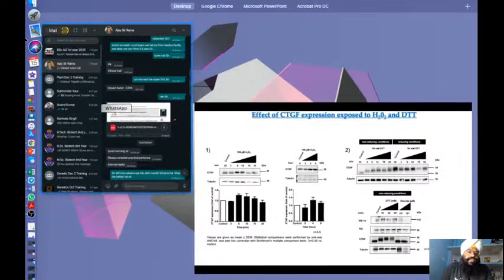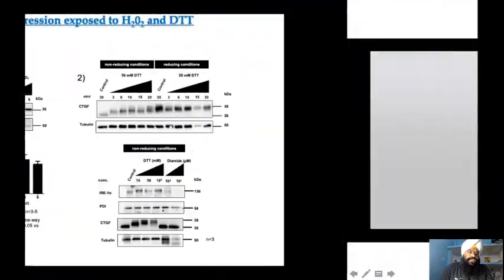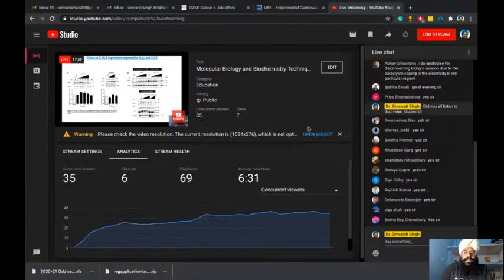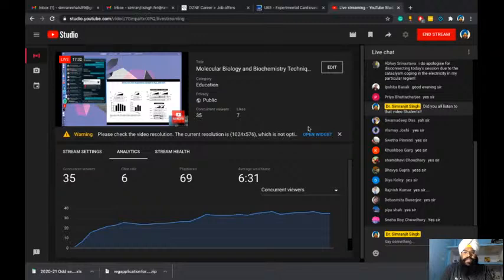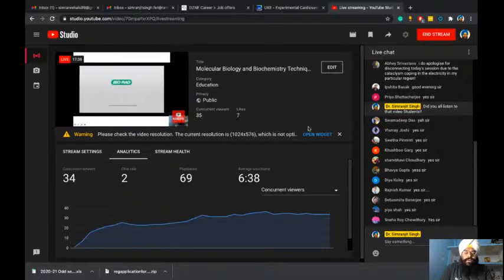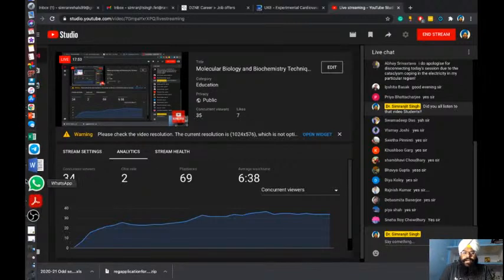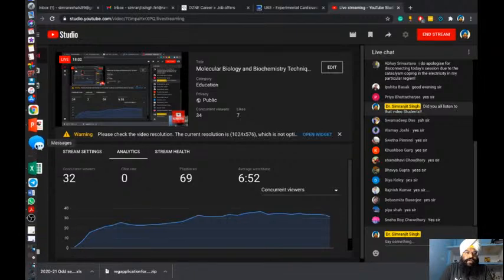So like this, I just showed you a simple application of how you can use Western blots in various ways. If you read some papers, you will see a lot of blots, protein work, IP, immunoprecipitation, DNA-protein interaction, protein interaction, protein isolation. All of this is only possible because of protein biology, that is your proteomics, and for that your SDS-PAGE. All these reactions are very important whenever you want to do it, so keep them in your mind.